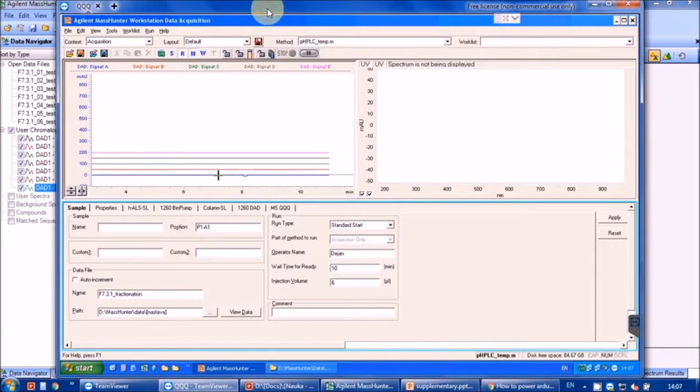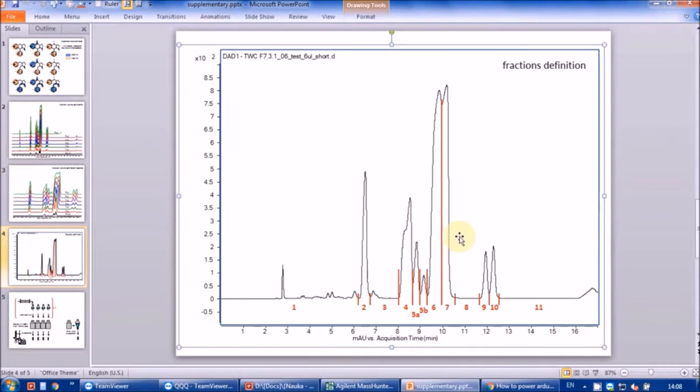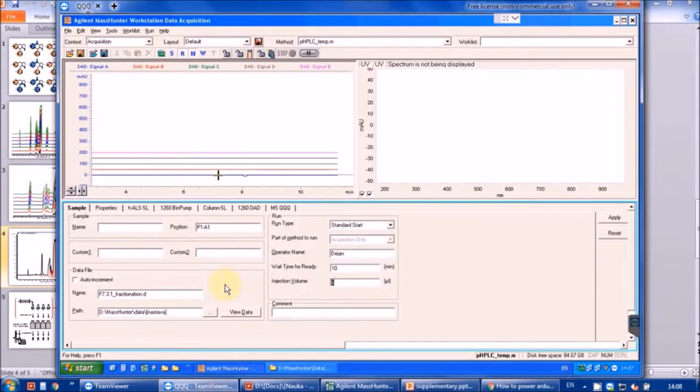Now we can finally perform the preparative separation. The 6 microliters of sample will be injected, and the operator will closely monitor the DAD signals and compare them to the previously defined collection schedule. Each fraction will be collected into a pre-labeled test tube or flask, with the needed vessel volume calculated according to the fraction duration and volume flow.